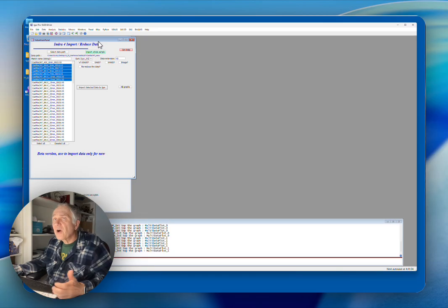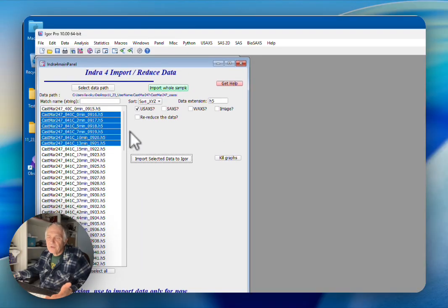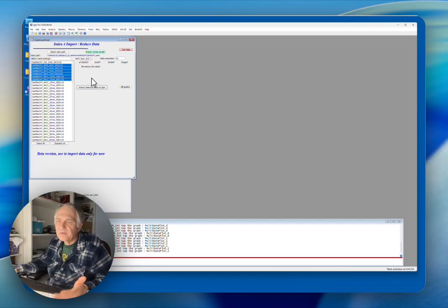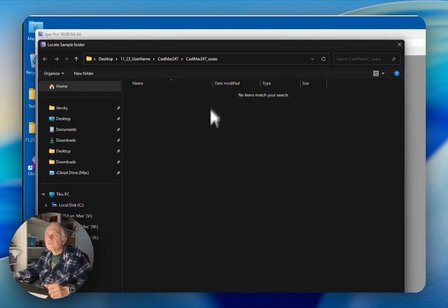Now, as a final step, if you just want to import a whole sample, what do you do? Because this means that you have to go through all of these, and now you may actually not pick the right folder, and you may be missing something. So there's another basically wrapper around all of these functions. You go in here, say import whole sample.